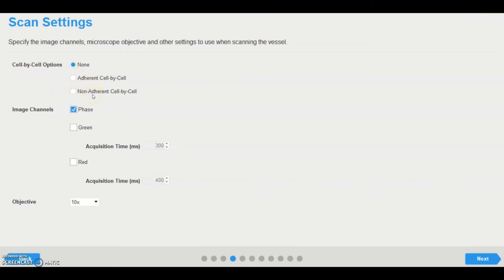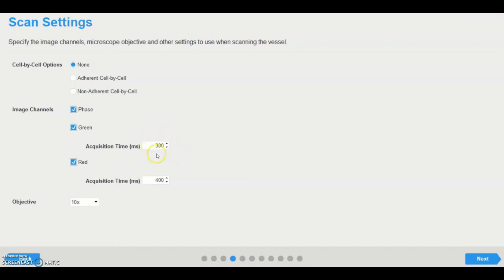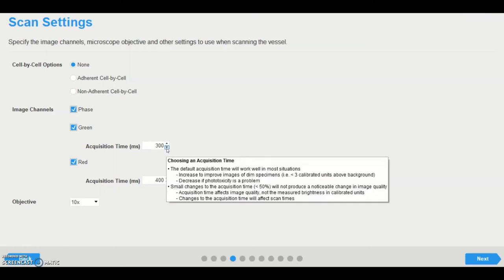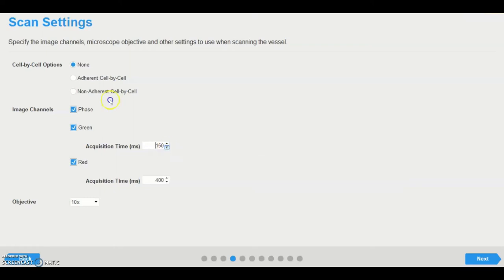In the scan settings page, the desired image channels and objective are selected. The fluorescence acquisition time, which is comprised of a series of exposures, is the length of time that the cells are excited. The acquisition time options are set to default values of 300 milliseconds for green and 400 milliseconds for red fluorescence. We have determined that these default times are the optimal exposures when scanning across a wide variety of fluorescent reporters using the Incusite. However, should it be necessary, it is possible to modify these values, for example in the case of fluorescent signal saturation when using bright fluorophores.